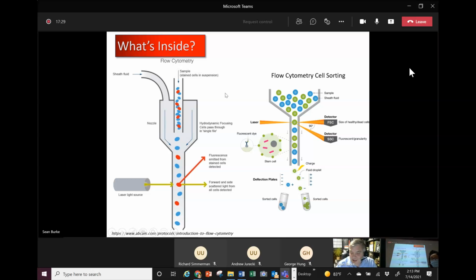Now, the other thing that a flow cytometer can do is, when those cells come through here, past this laser, I only showed that they end up down here when they go past the laser. What actually happens? Well, when we're just analyzing those cells, where we're just trying to make static measurements of what's going on, they just go into a waste bin, right? They usually end up in a little bin that has some bleach in it to kill the cells, so nothing grows, and all the bad bacteria and viruses that you might have treated them with die and get killed.